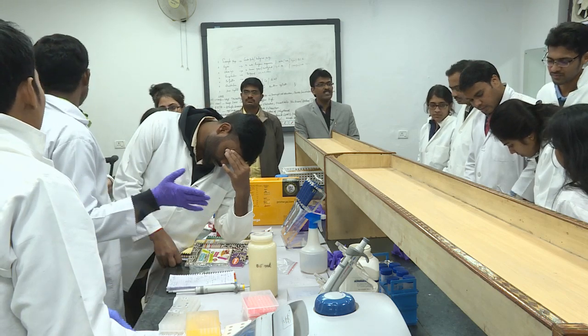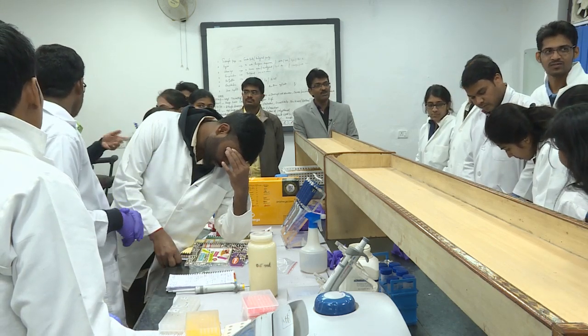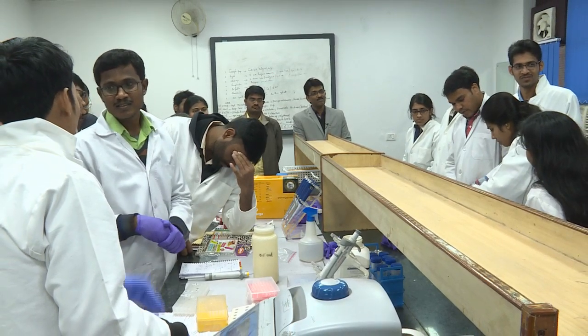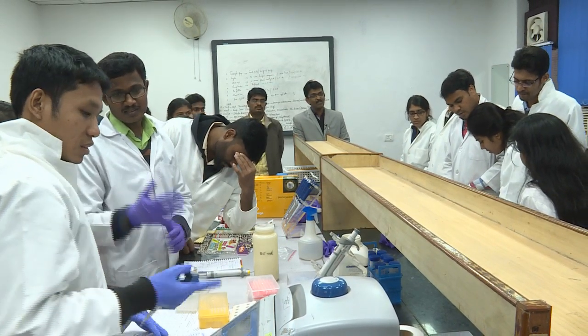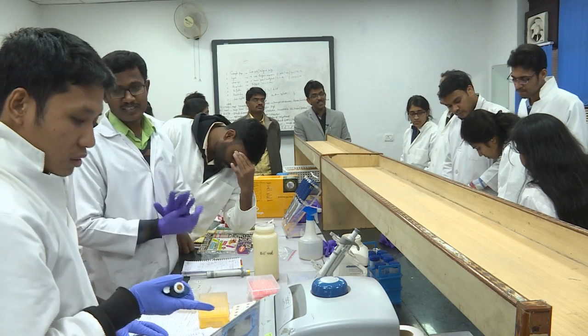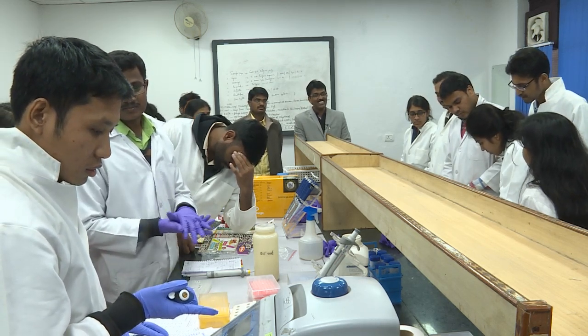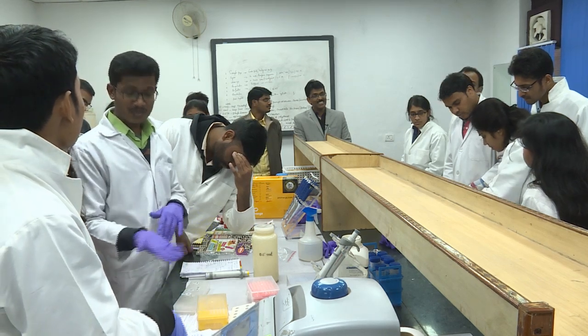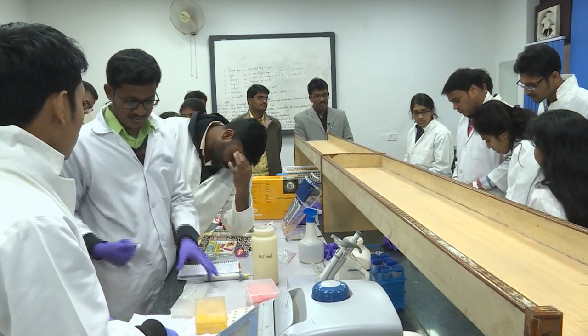So 5th group, what is the reading? You would like to know? Quantitation? 4th group. Again you extracted. Okay, fine.